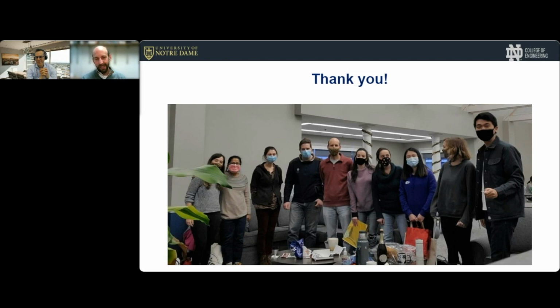That is a problem. I think we've avoided that mostly by not using OCT images where we have significant drop-off in the signal. But I don't know how you would determine exactly where your focal plane is just by looking at the image. So my best practice advice would be actually to make use of one of the artifacts that we usually get in OCT images, which is the so-called autocorrelation.